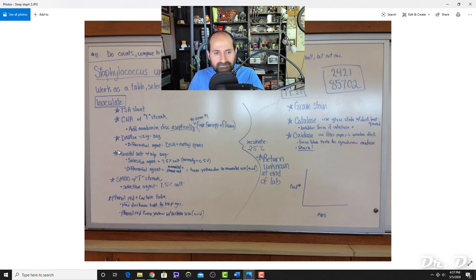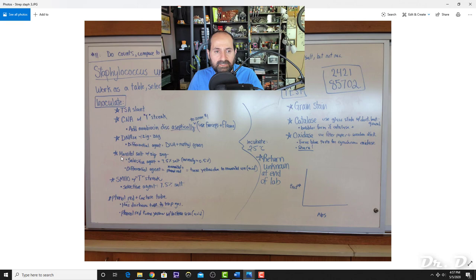The SM110 plate is simply a selective plate—not differential. It is a high-salt plate, so bacteria that grow on SM110 are halophiles.